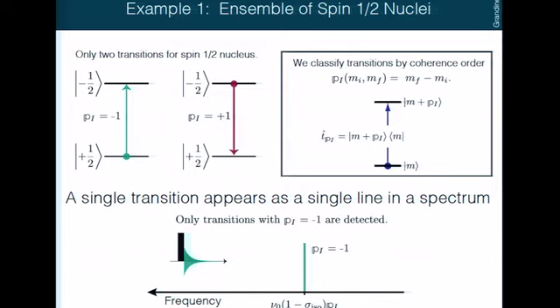So what's the p-value? The p-value is simply m final minus m initial. So this is p, m final minus m initial. So we will classify transitions by their p-value. So we're having a transition from m to m plus p. And there are going to be lots of transitions with the same p-value, many transitions with different p-values. Anytime you do an NMR experiment, you can only observe a transition with p of minus 1. This p plus 1 transition you won't be able to detect.